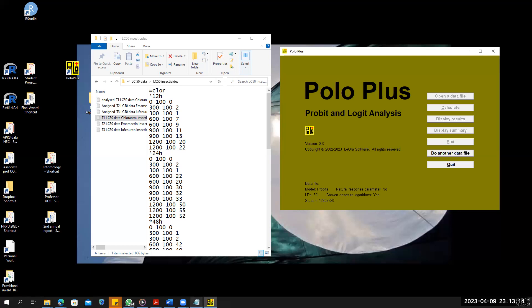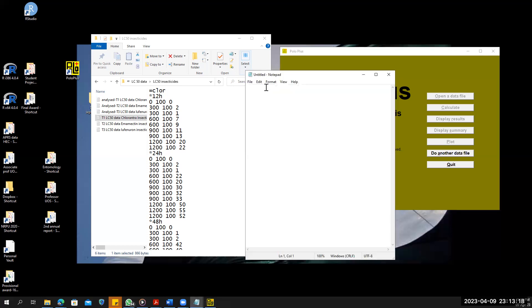Open the computer, open Notepad, and open the file. Enter the data here. Here you have the treatment name, then start. If you calculate the data at 12 hours, 24 hours, or 72 hours, let's say I do for 12 hours — so type '12 hours' then press enter. After that, the first digit should be the concentration, the second number should be the total number, and the third number should be the number dead.